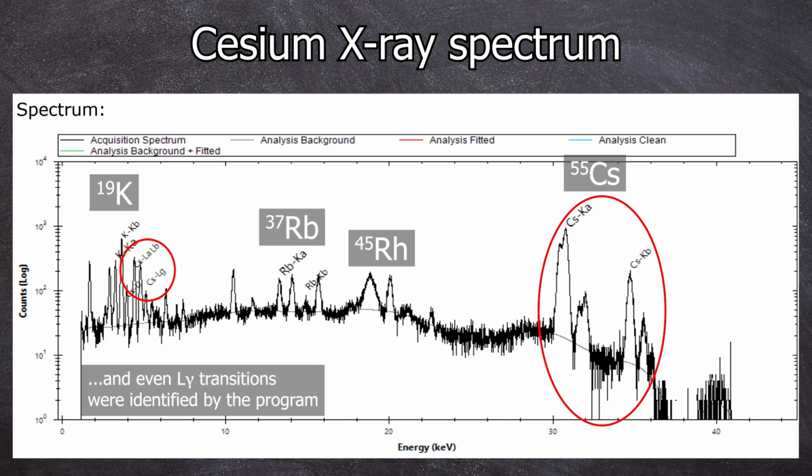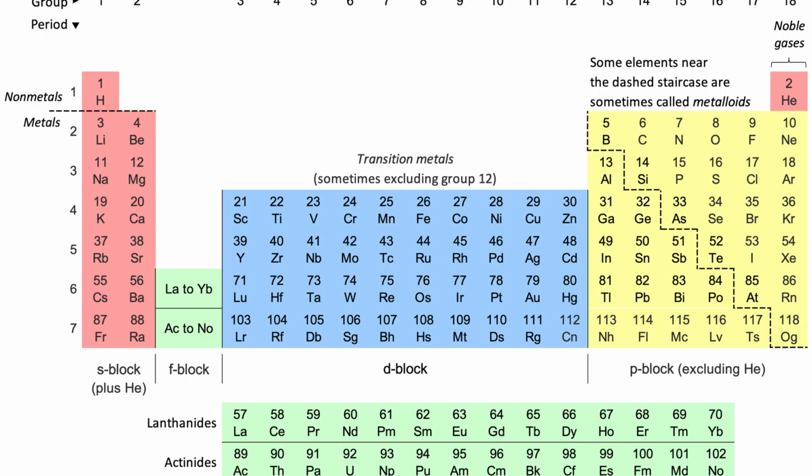And then there's potassium with an atomic number of 19. And for those who have memorized all the alkali metals, the rubidium line can also be explained. It is the lighter chemical homologue of cesium and can only be separated from it with significant effort and chemical separation processes. So there are some traces of rubidium inside of my cesium ampule. Since the measurement device can also detect relatively minor impurities, they appear in this spectrum.